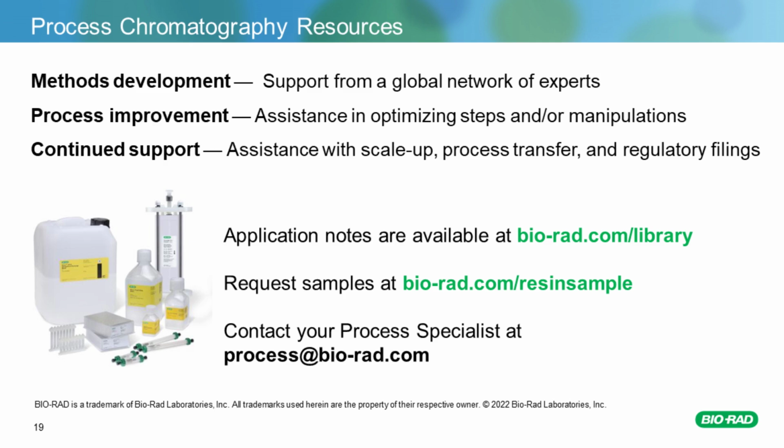So that's not a one-size-fits-all question. It would be possible, depending on the initial synthesis that occurs. If you have a pretty pure sample coming out of that, then you could possibly do that. But typically, you'll see the HIC done as the initial capture, and then the anion exchange column is used for that final polishing, getting rid of any DMT-on oligo species that might not have had the DMT removed. So it's possible, but usually you will need more than one step.